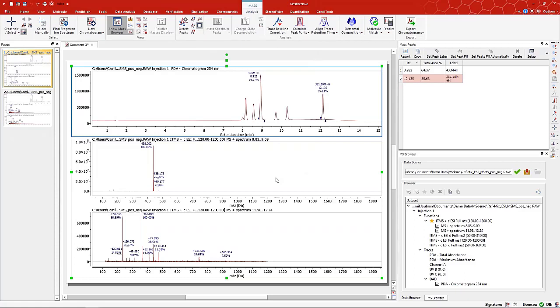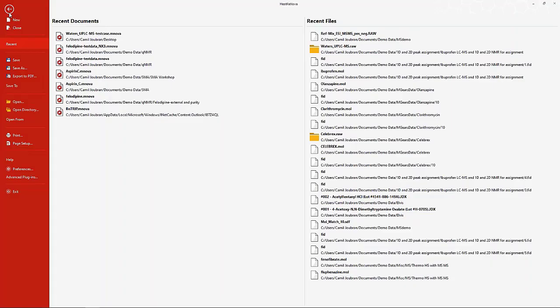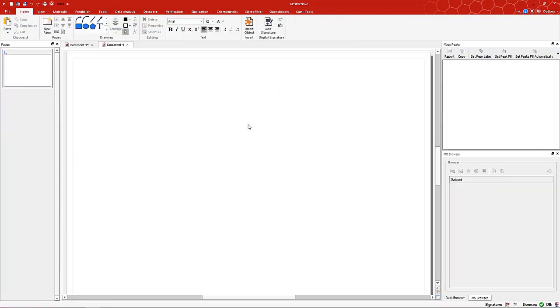At this point, what I'd like to do is switch to the other data set that I forwarded to you guys. I'm going to keep this data set here. We're at about 35, 40 minutes, so I want to go to the different data set and just show you some other options. On mine, I have the new page. I can add it here, or you can go File, New, either way. I'm just going to click on New.